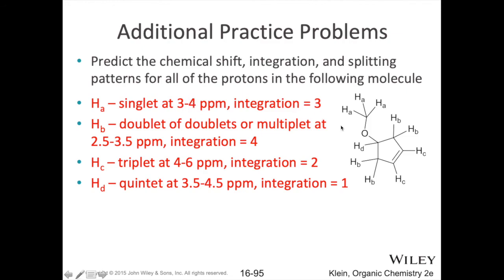Okay. Hydrogen B, both of these hydrogens are equivalent. You can kind of picture that this ring forms a sort of plane.